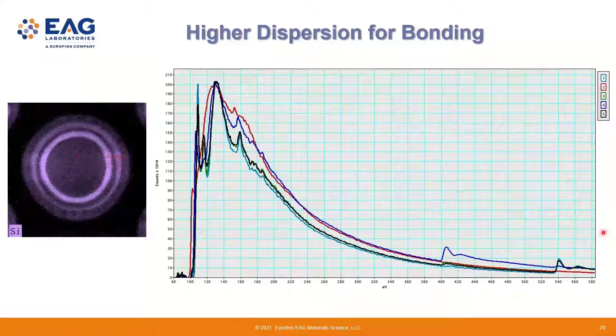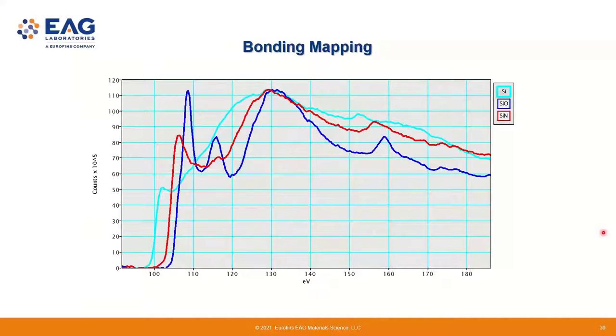One thing that is nice with the monochromator is that you can tune it and go in between. If you go for the ultra highest energy resolution, you throw away a lot of current, but you can go to some intermediate step and have a nice compromise between a decent amount of probe current and still a moderate energy resolution. For example, in this case, the dispersion is, I believe, 0.75 eV per channel. Of course, then you don't see much need for a monochromation, right?